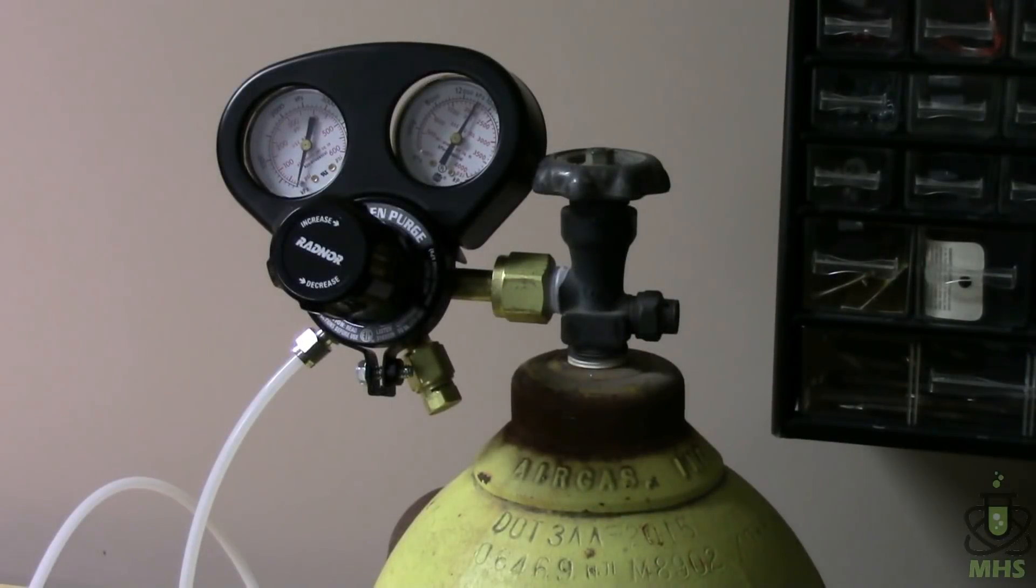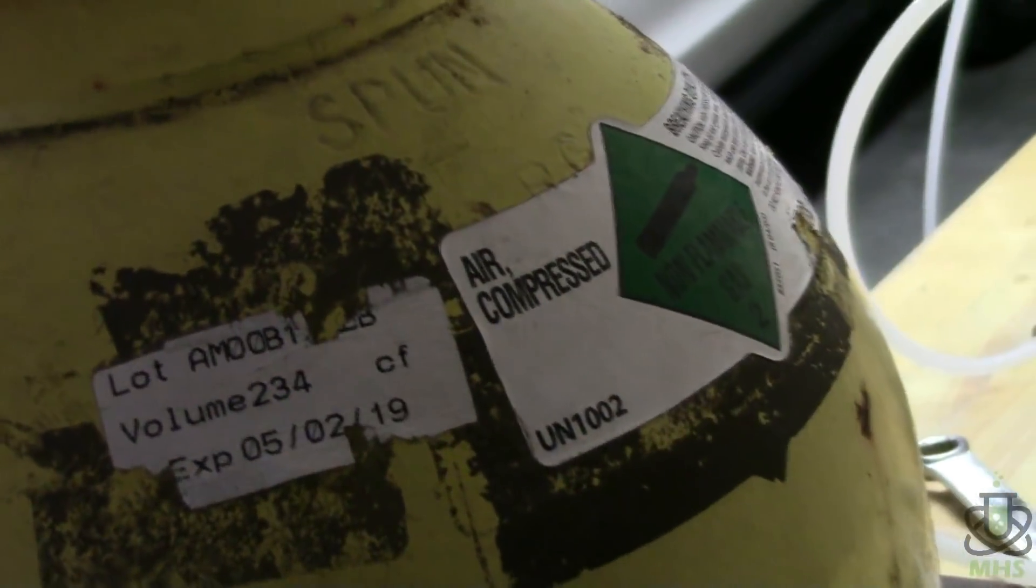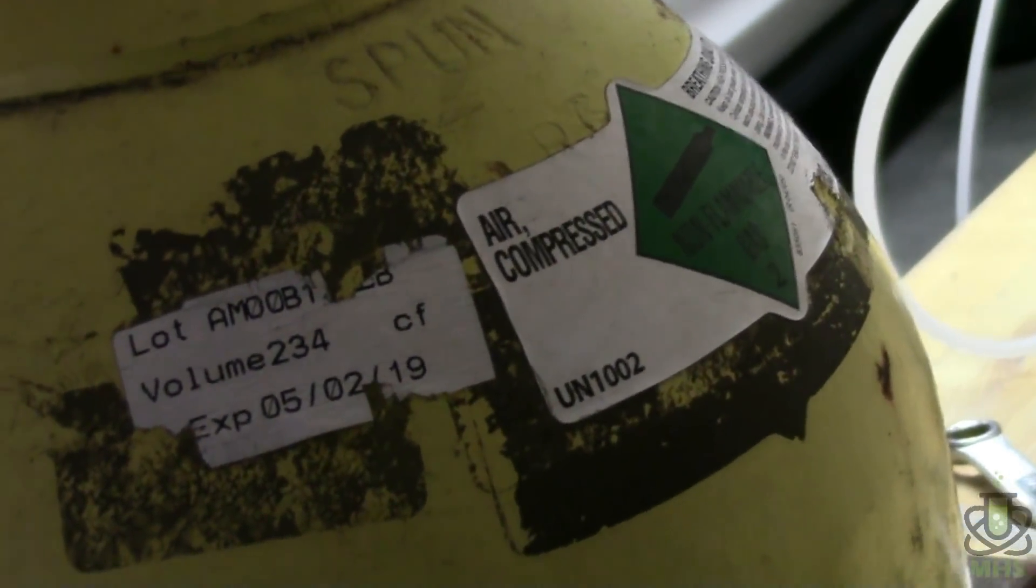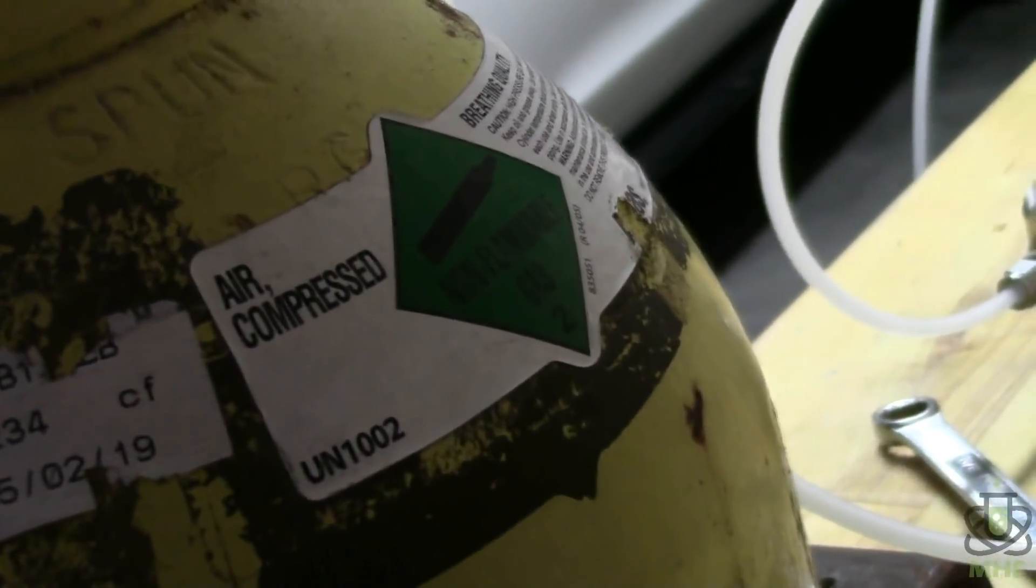So here's the first piece in the system. This is a size 200 compressed air cylinder that I bought from my local air gas store and that's attached to a regulator which I also bought from air gas. And then if we come around to the back of the tank you can see that it is in fact compressed air.